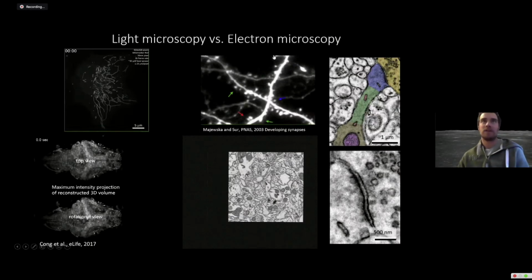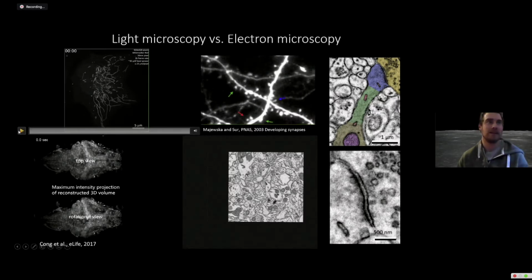Here's some more data that we look at in our work a little bit more. Using a light microscope, you can see a tree in the forest of the brain, for example, and we can go into that a little more after, maybe in the Q&A period, if anybody's interested in talking about this organization of the brain. In an awake mouse, you can see labeled neurons pulsating, and that's how they exist in life.